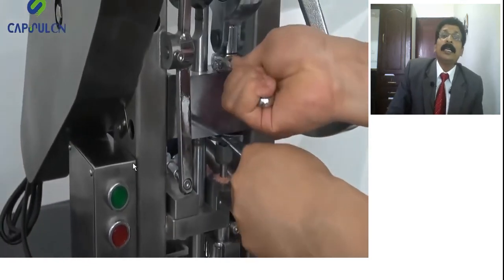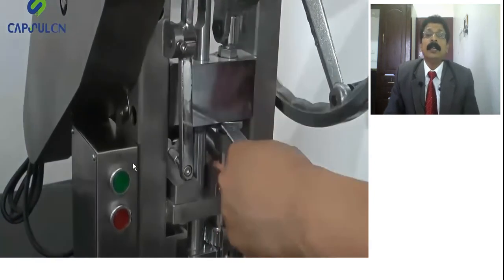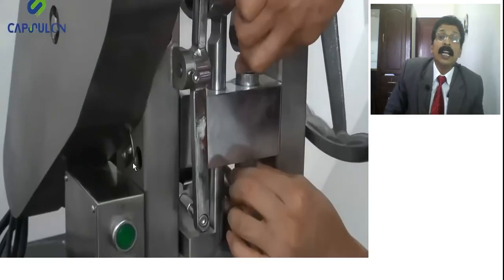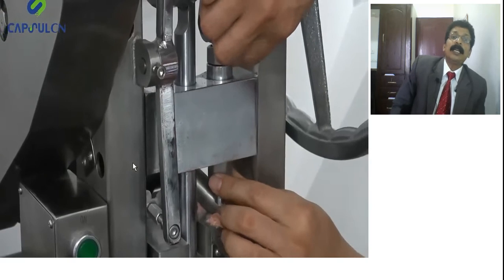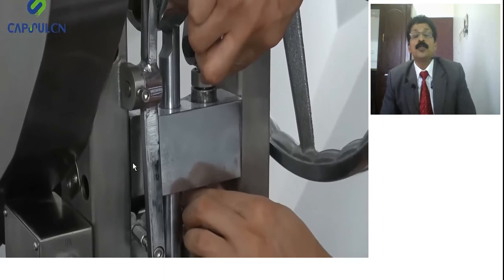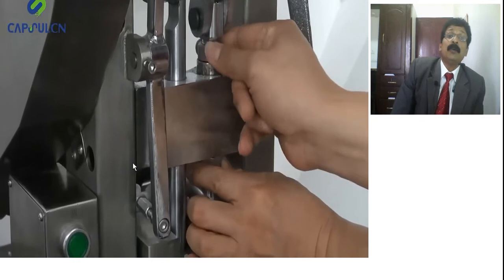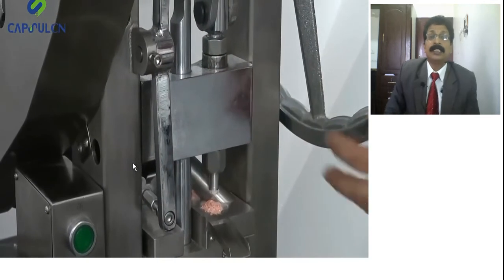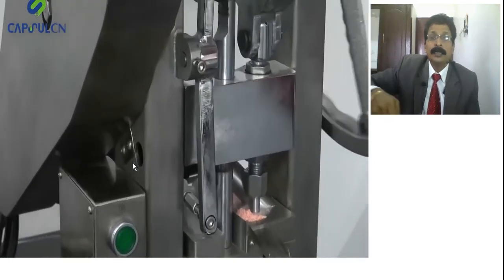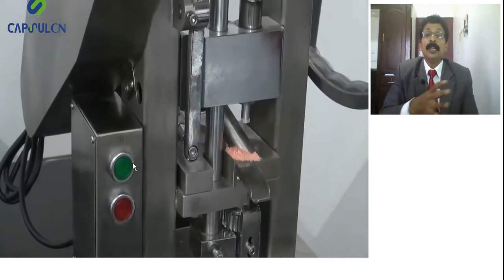So he adjusts the upper punch, because it is the compressor for the single press technique of the machine. He is lengthening it and making it a little more down, and again he tightens that bolt so the upper punch comes down. When you watch that video, you have to watch carefully. Now he is fixing that upper punch, and again manually rotating, and it goes down and presses. Now you also see the hardness is not proper. So like that, it is trial and error.